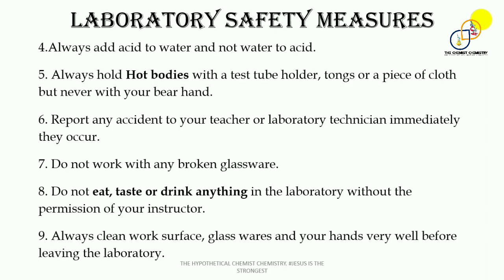Alright, the fourth point is always add acid to water and not water to acid. Why? Because anytime that you try to add water to acid, the acid will splash on you.